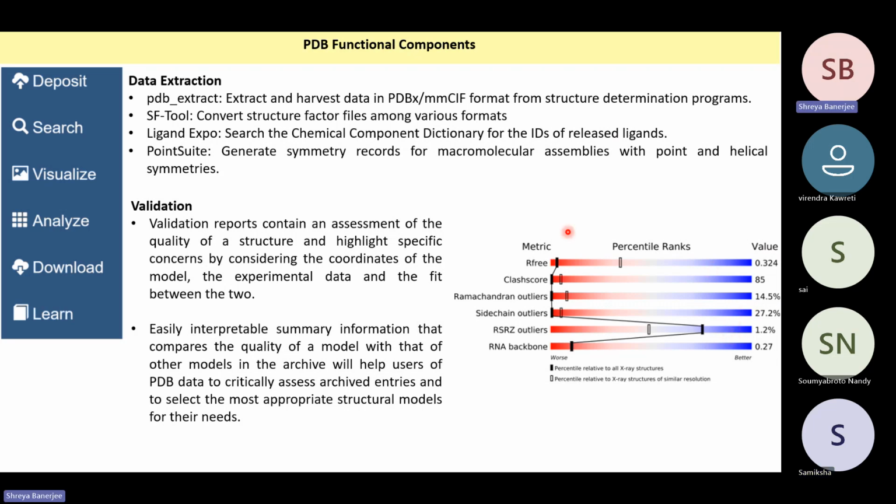Yes, so this is not a very good protein structure because 14.5% of the amino acids are lying in the disallowed region of the Ramachandran plot. If it were 10% or less, it would be a good protein. Correct. This is just an example shown where the report is not very good, so this kind of structure will not be accepted in the PDB.